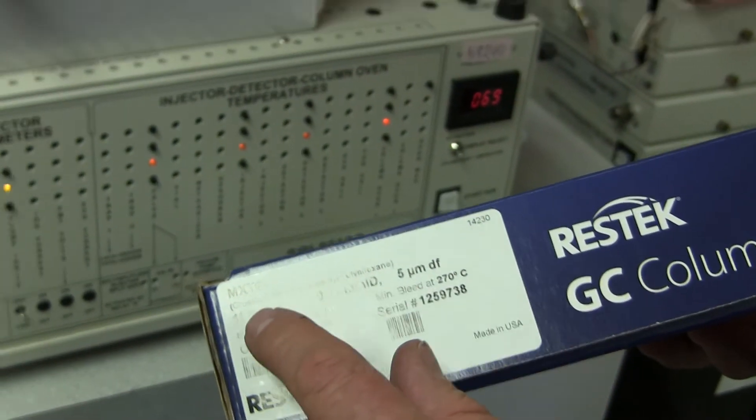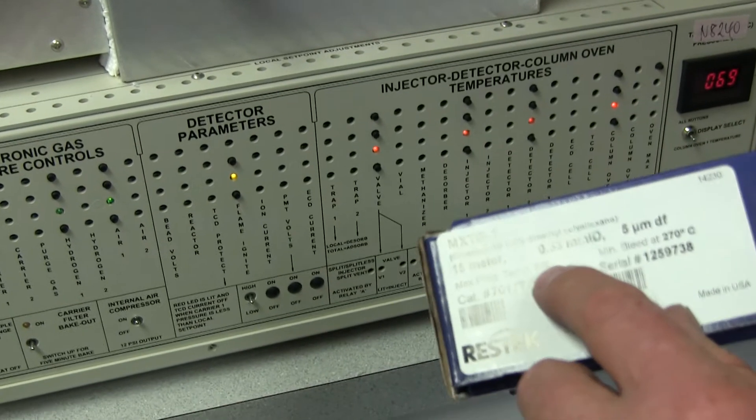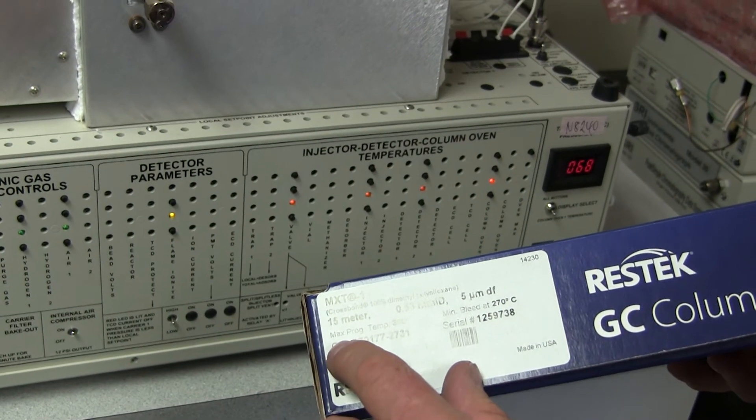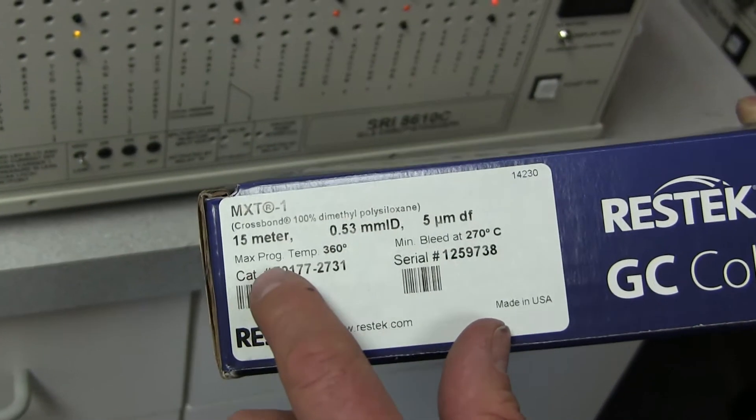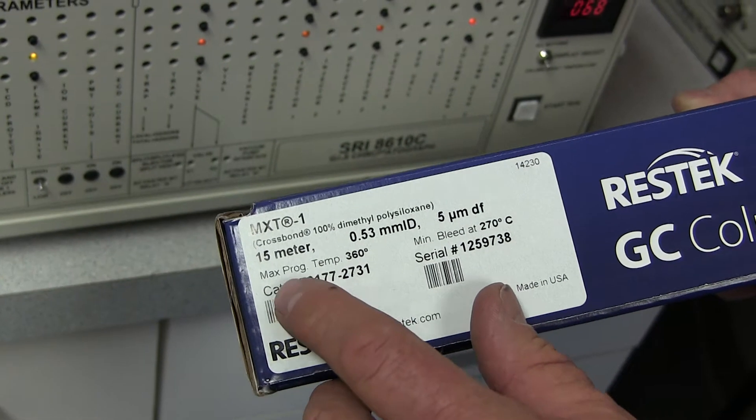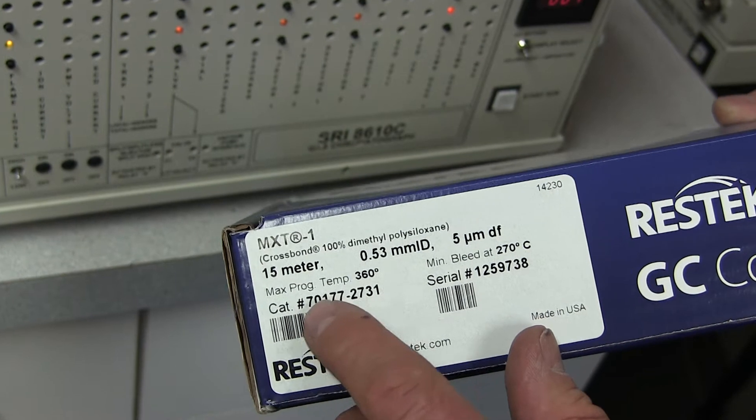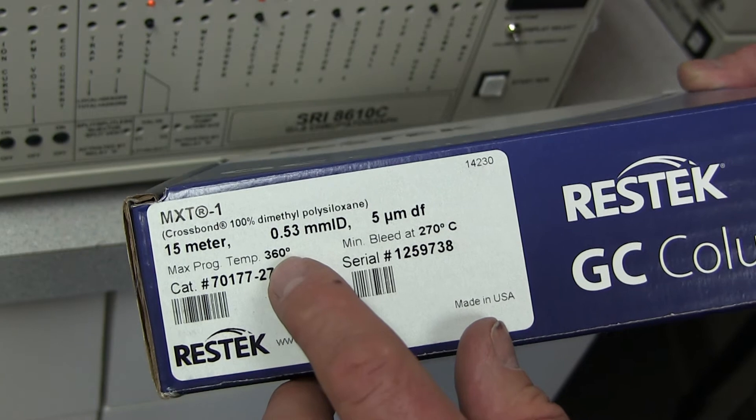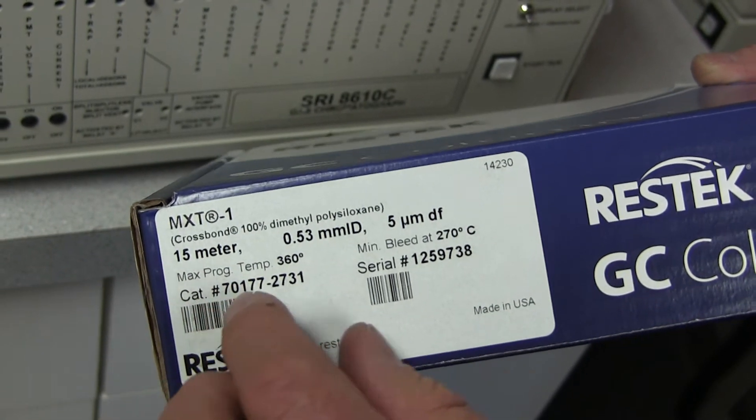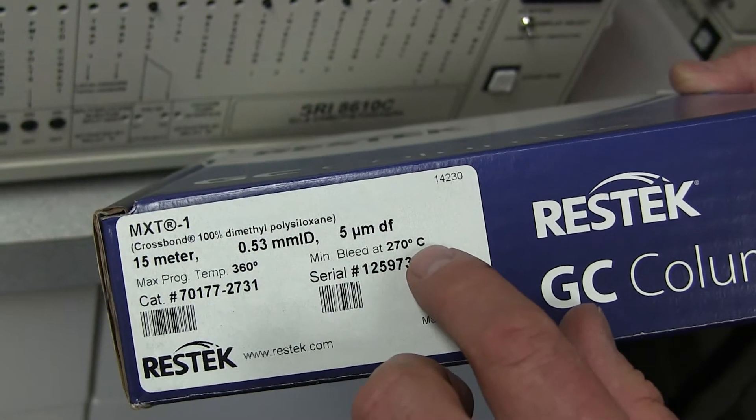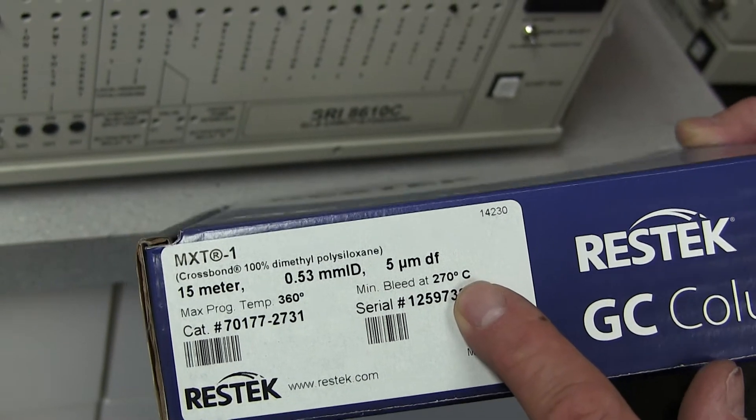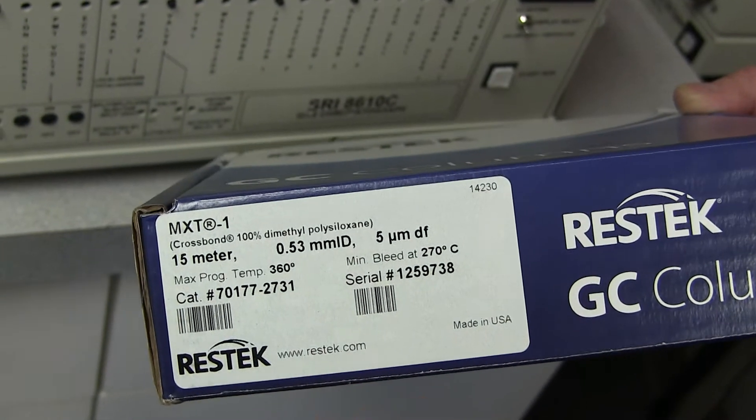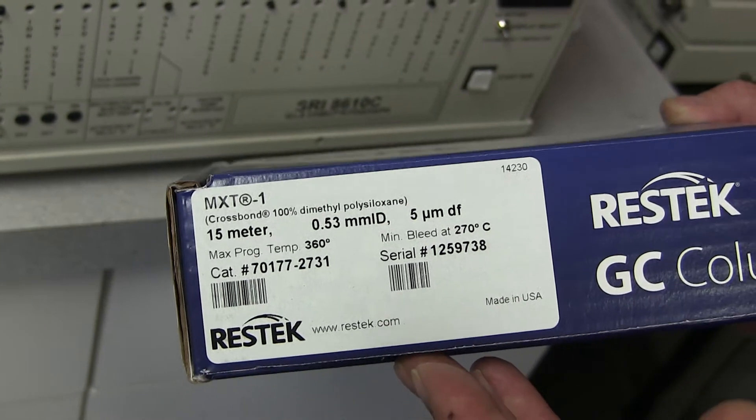What they're really saying to you is you can't really take it to over 360 degrees, and if you do take it to 360 degrees, then you can't stay there for very long because that's called a programmed temperature. So really, the maximum temperature of this column to be safe is probably more like 330 or 340 degrees. You really don't want to go right to the limit of what Restek says is safe for a very small amount of time. They're also telling you that the minimum bleed at 270, what that means is if you go over 270, you can expect there's going to be lots of increased baseline bleed, which is a rise in the baseline when you go over a certain temperature.